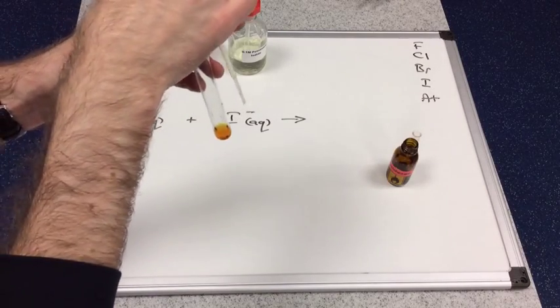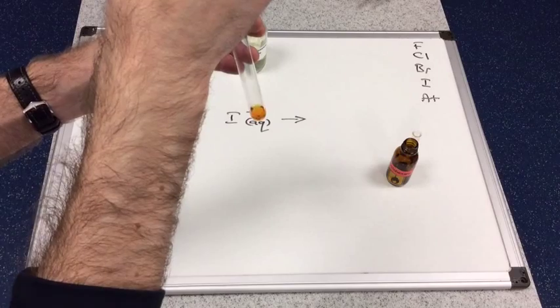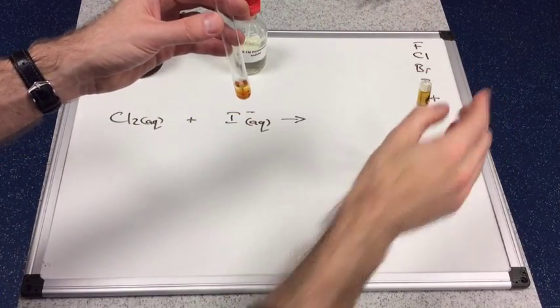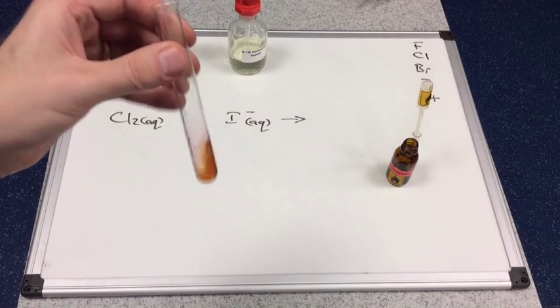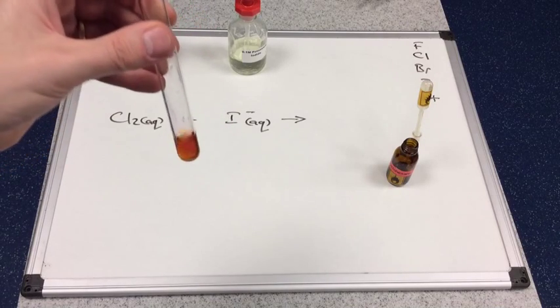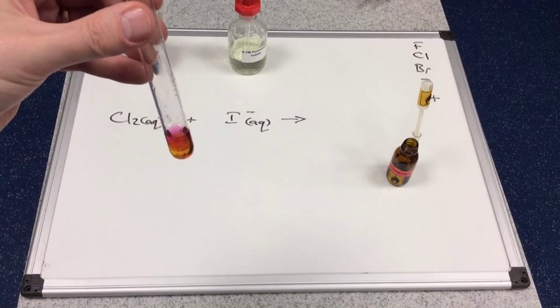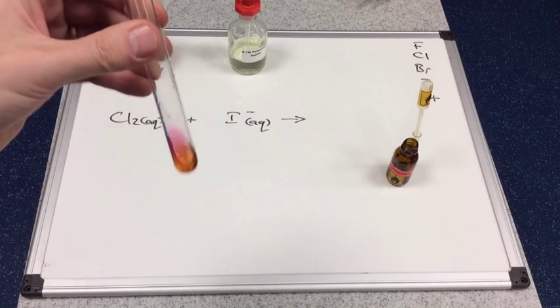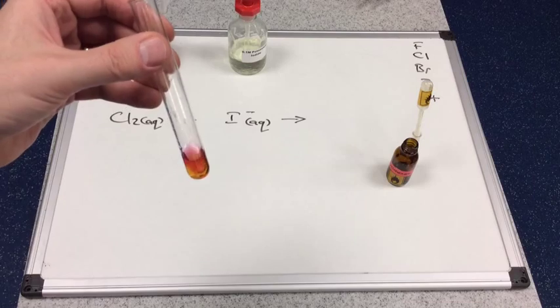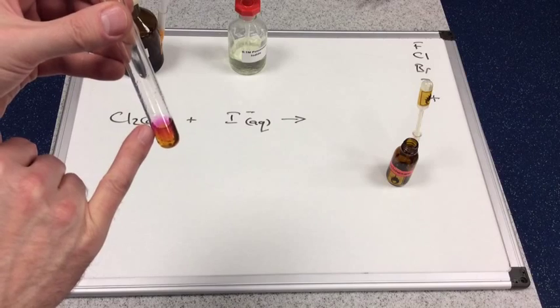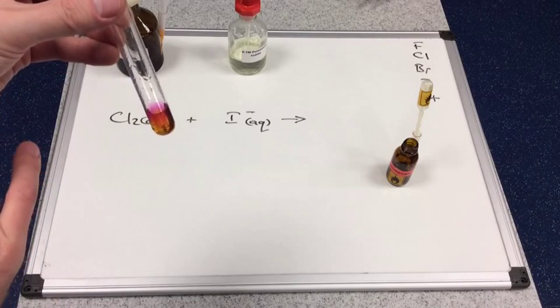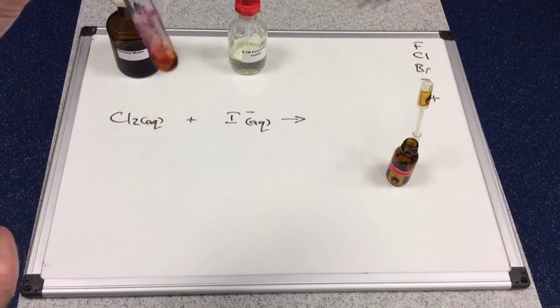We'll put some cyclohexane in to see the true color of the halogen that's in this test tube. So hopefully you can make out against the white background of the whiteboard we've got this nice violet or purple color inside this top layer, the cyclohexane layer, the non-polar layer.